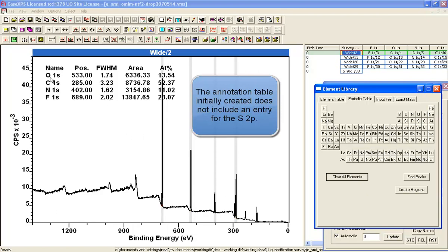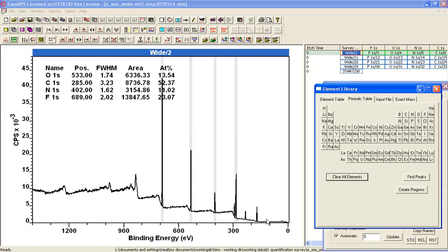Now, there were five peaks identified, five elements, Oxygen, Carbon, Nitrogen, Fluorine and there was Sulphur. But Sulphur has not had a region created.